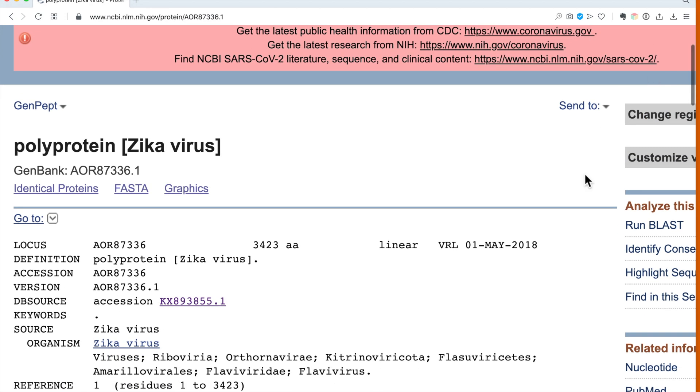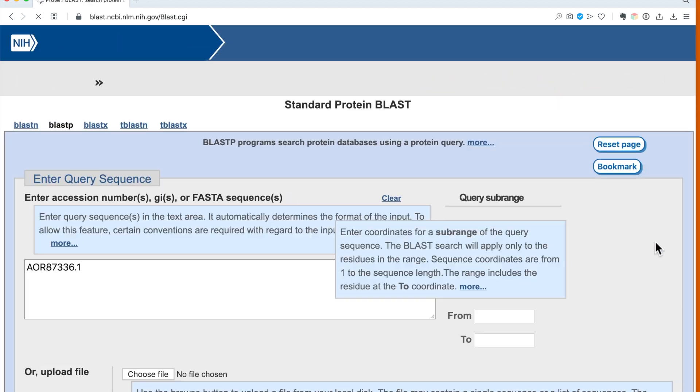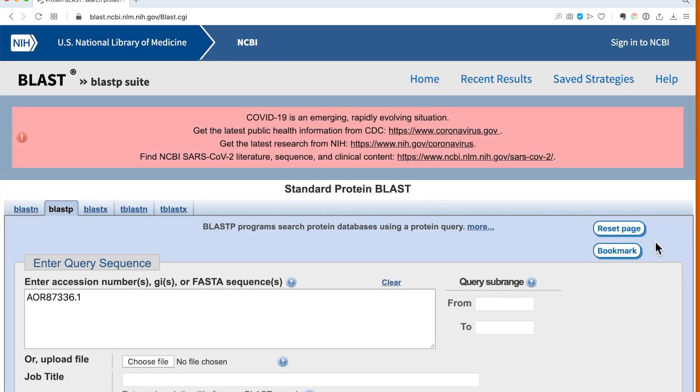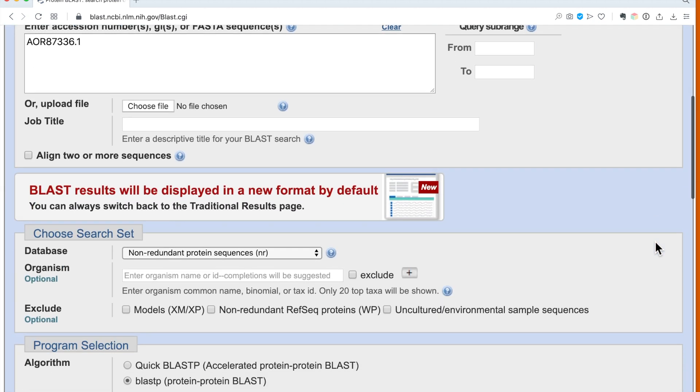Now you can see in this window on the right hand side there is a link to the BLAST suite, so clicking on it will get us directly into the standard protein BLAST because we have searched for a protein.